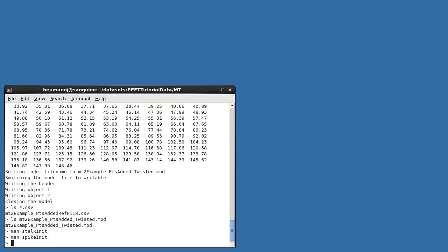So now you've seen several examples of how to align and average subunits which repeat along a filament. Additionally, you've seen how to create initial motive lists for some common situations.